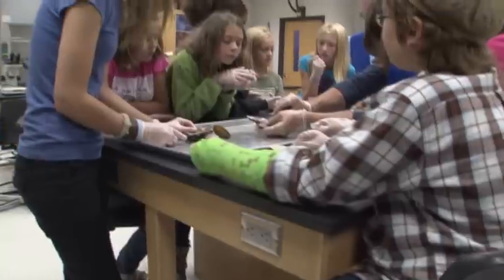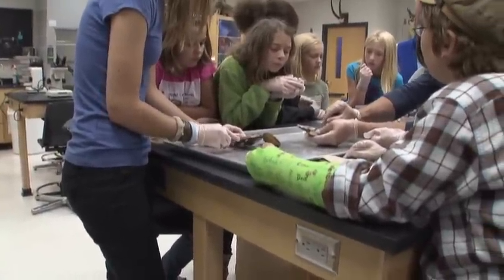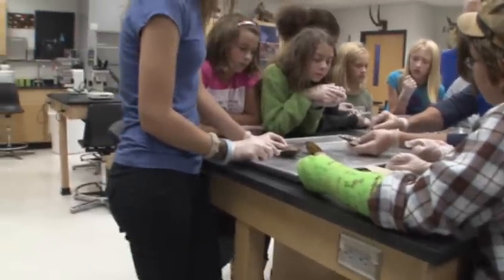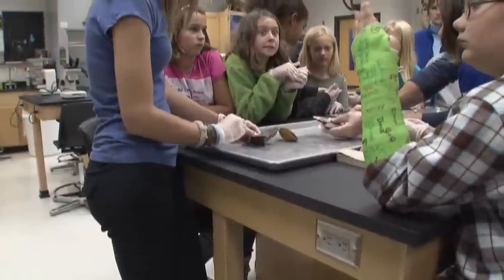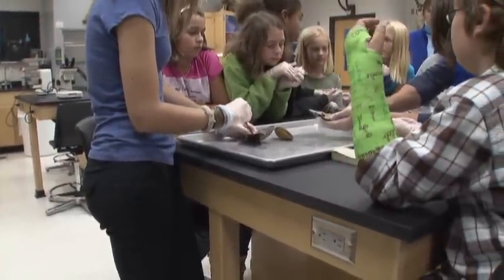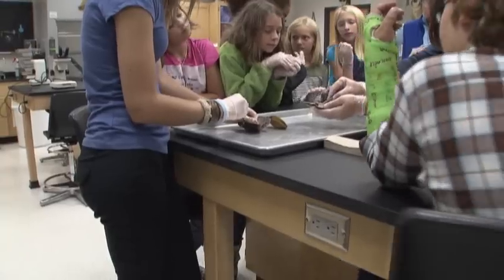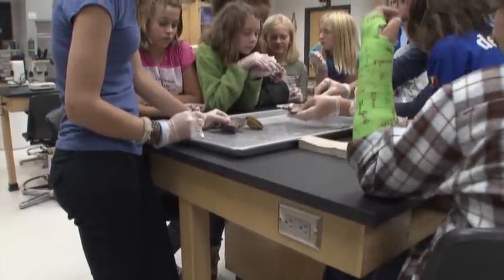This is what's left of the coelom right there. That's the cavity. And the kidneys are down below here, and this intestine goes through the heart, not around it, through the ventricle. Isn't that weird? So water is taken in here, goes over the gills, around here, and then it all goes out this chamber over here to this one over there.